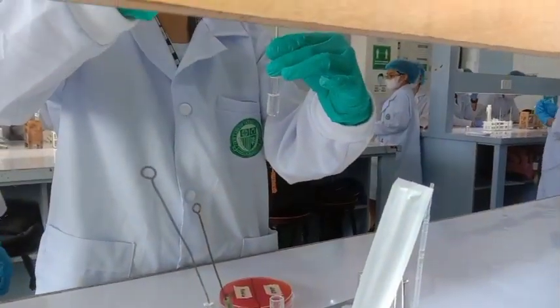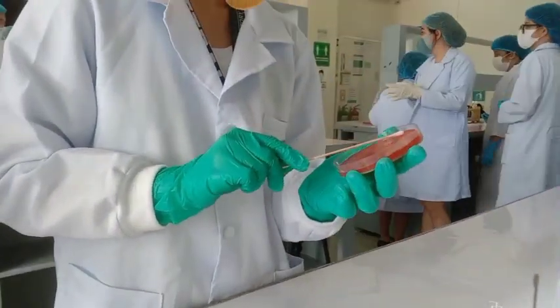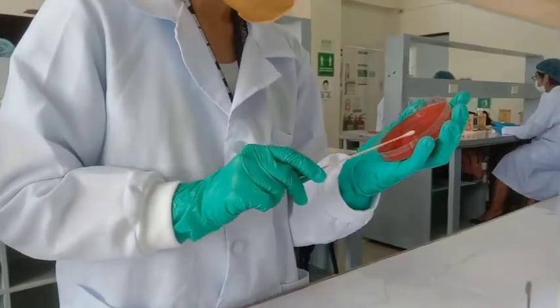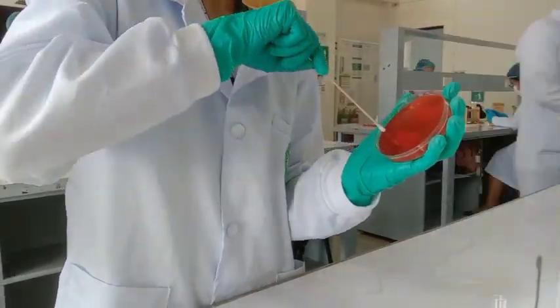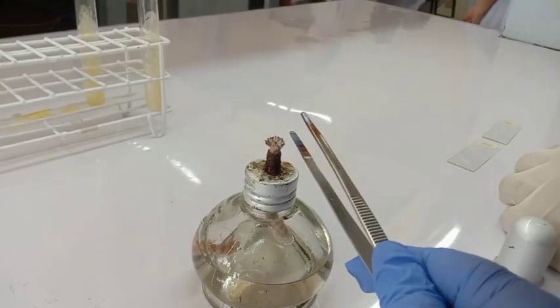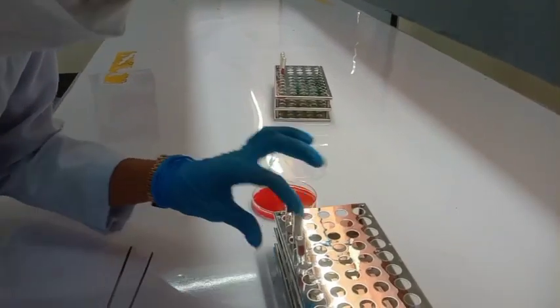Repeating the same steps, inoculate the organism from the broth and then streak it using an overlapping streak on the blood agar plate. After that, we can now proceed to placing the discs on the blood agar plate.